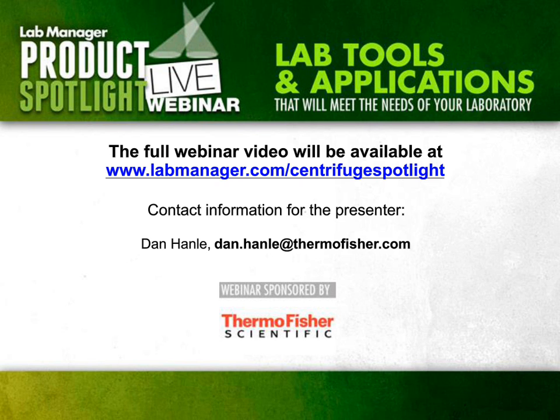We had a case, it was just last week, I think, and a person called up. They were having a problem, and it was a blood bank. What we found out is somebody had cleaned the rotor properly, but for some reason they had missed one of the trunnions. And so one of the buckets wasn't swinging smoothly. The other 5 were. When they didn't clean it, they were getting suboptimal performance, but they were living with it. When they started cleaning but didn't clean properly, all of a sudden their separation was messed up because the rotor was slightly imbalanced. The obvious answer was clean them all, have them all properly greased.